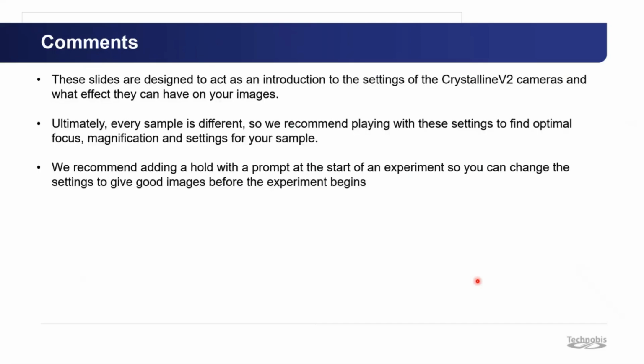So some comments on the cameras. These slides are designed to act as an introduction to the settings and what they can do to affect your images, but ultimately every sample is different. So you need to play around with these settings in order to find what will work best for your samples. And as I showed during the designing of the experiment, we recommend adding a hold step with a prompt at the beginning so you can change these settings without them affecting the beginning of your experiment. And these settings can also be changed at any time during the experiment if you see your crystals are not in focus.